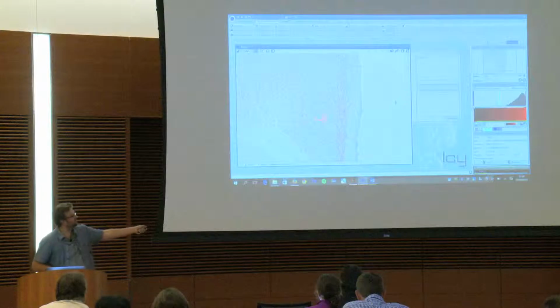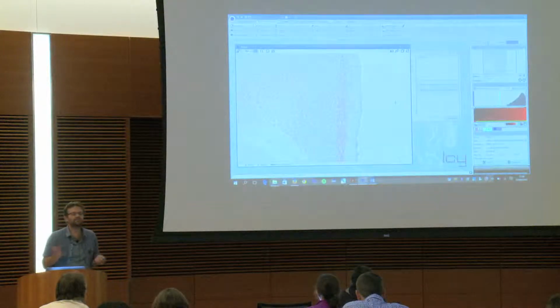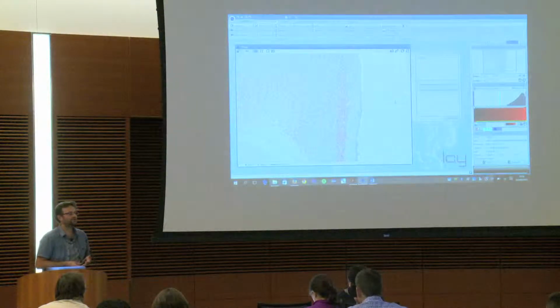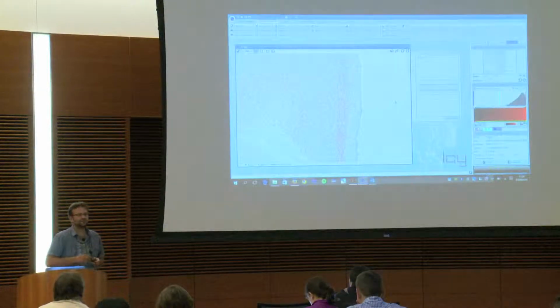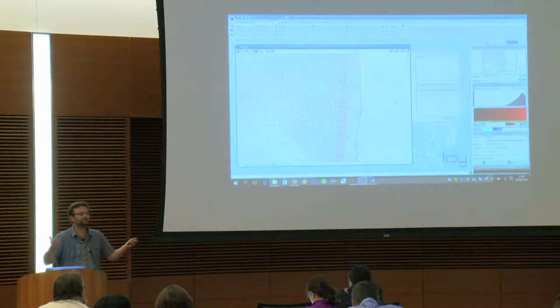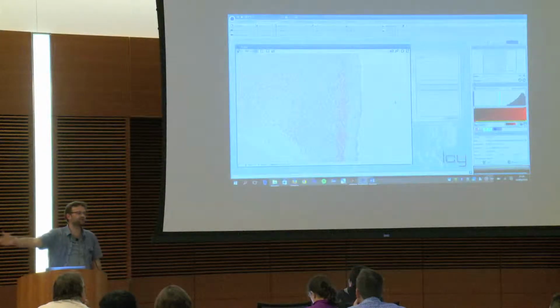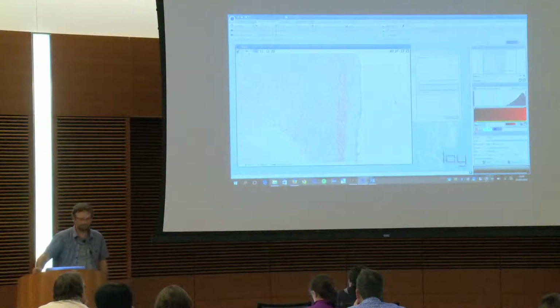And you have those spots that are here. So I have an obvious question for you. Do you believe that they are detecting the proper neurons? You see, we are above the tool. We don't mind about how you do this and so on. Now the question is, what do I do with my data? Maybe they are completely wrong.